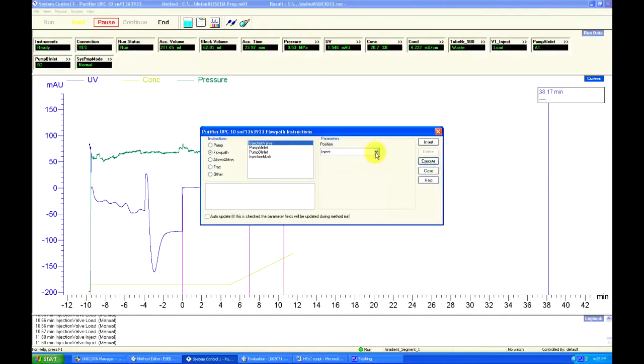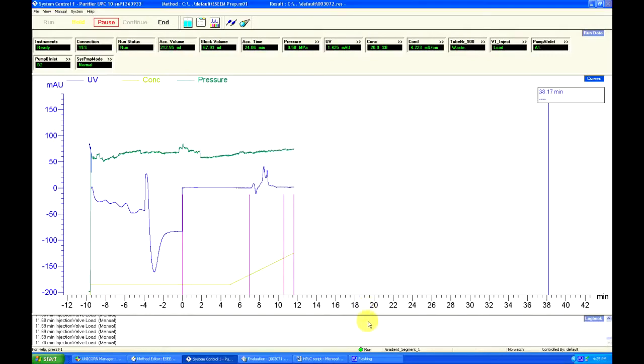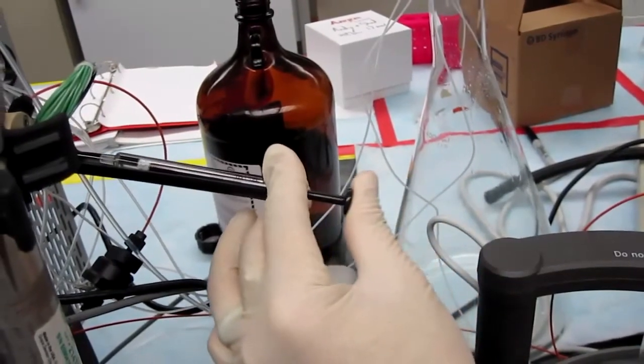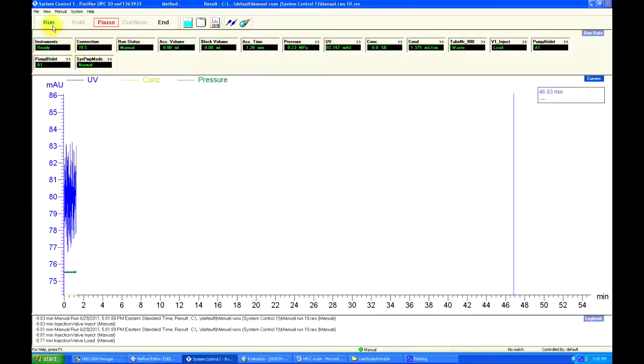Once the needle is attached, we can change the parameter back to Load. Make sure to click once or even multiple times on the Execute button to ensure you have an airtight seal between the needle and the injection valve. Then we can inject our sample. Now we can start our run.